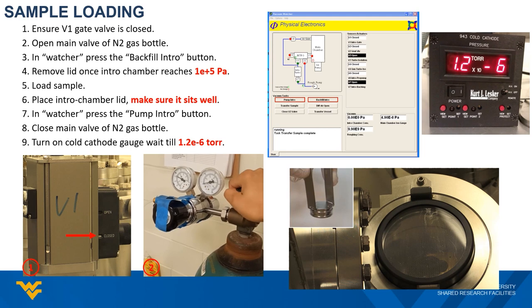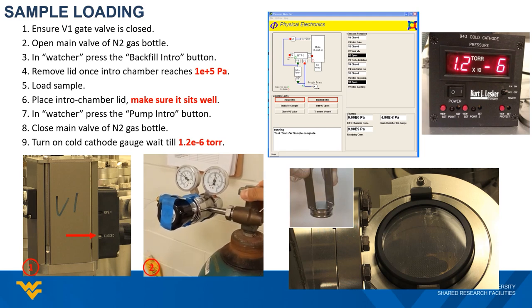Next, open the main valve of the nitrogen gas bottle attached to the lab wall. Here we use ultra-high purity nitrogen gas to vent the intro chamber during the loading process. The regulator is preset, so there is no need to adjust the regulator and secondary valves on this cylinder.